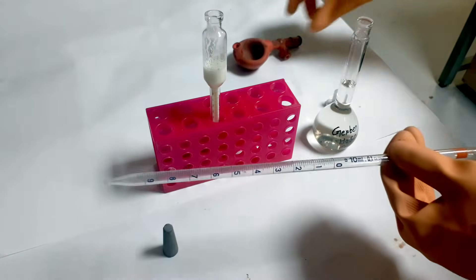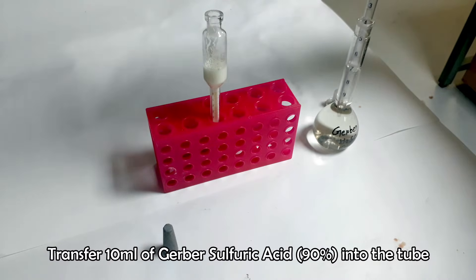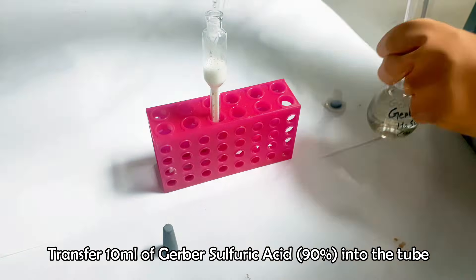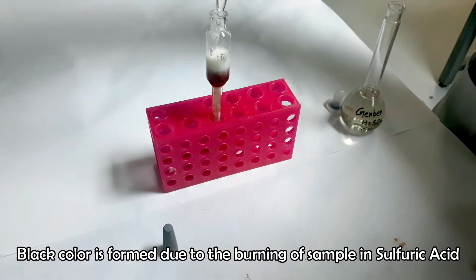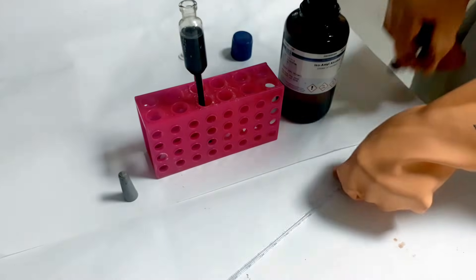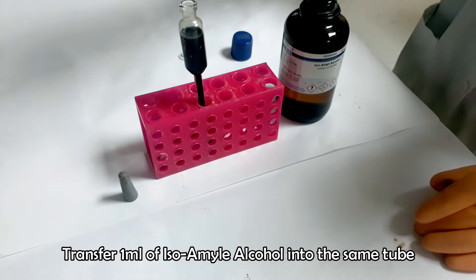Keep the Gerber sulfuric acid at 4 degrees Celsius. Now add 10 ml Gerber sulfuric acid. The sample will be burnt and a black-colored solution will be formed due to the burning of the sample in acid. Now add 1 ml isoamyl alcohol into it.